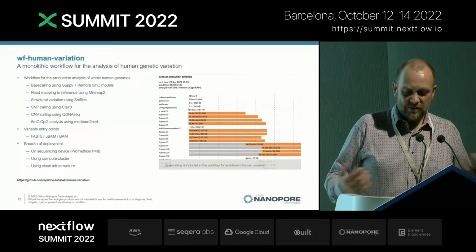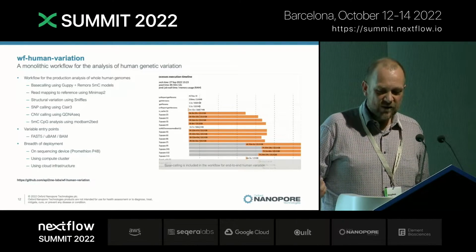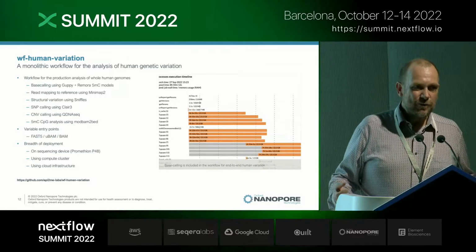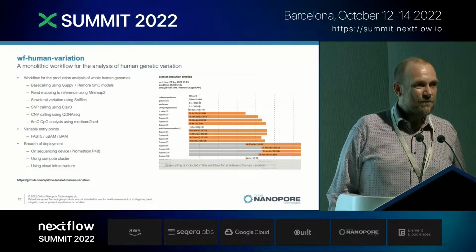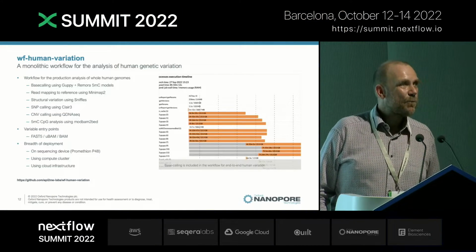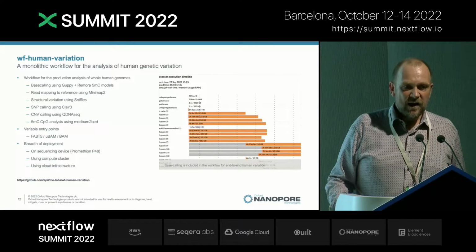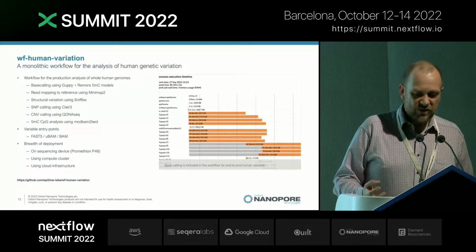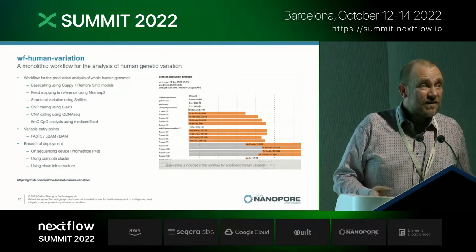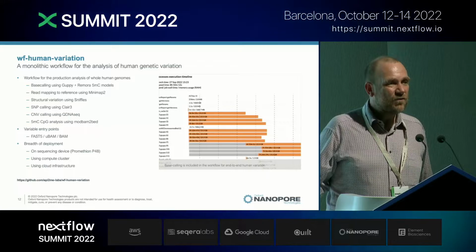So here we can see that we've got many hours spent just performing this base calling process. Why are we only using 8 GPUs? Well, discussion with some of the cloud colleagues here reveals that GPU is a very complicated commodity to get within the cloud. They are rare, they are scarce. So we've got a GPU limitation within the system. But that's fine, because the rest of the steps within the analysis parallelize extremely well.